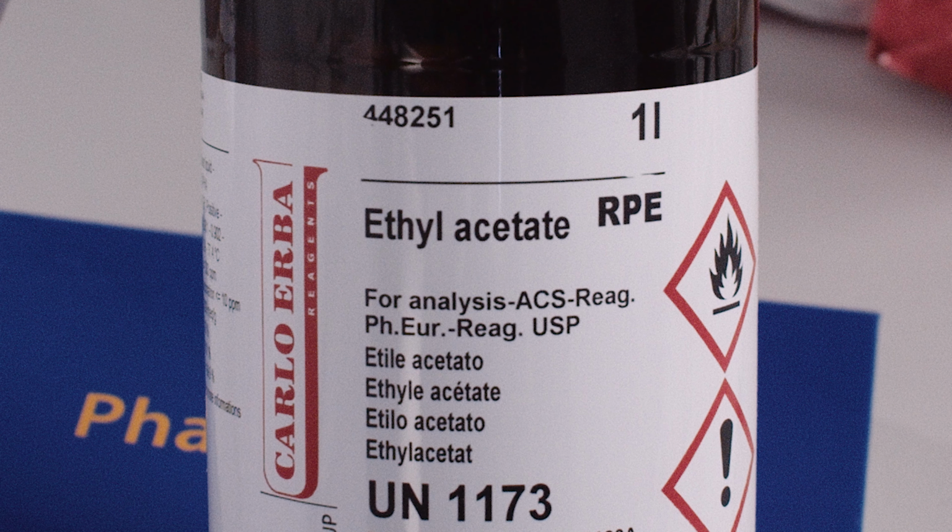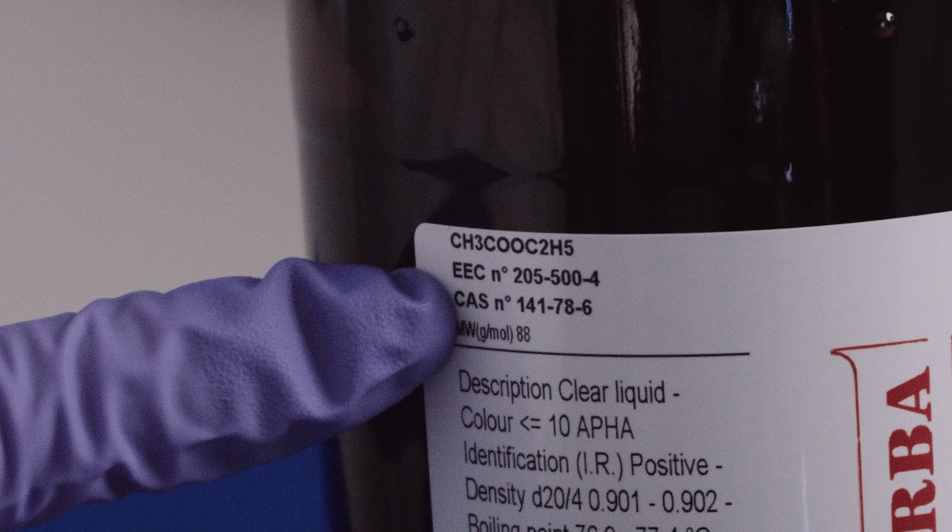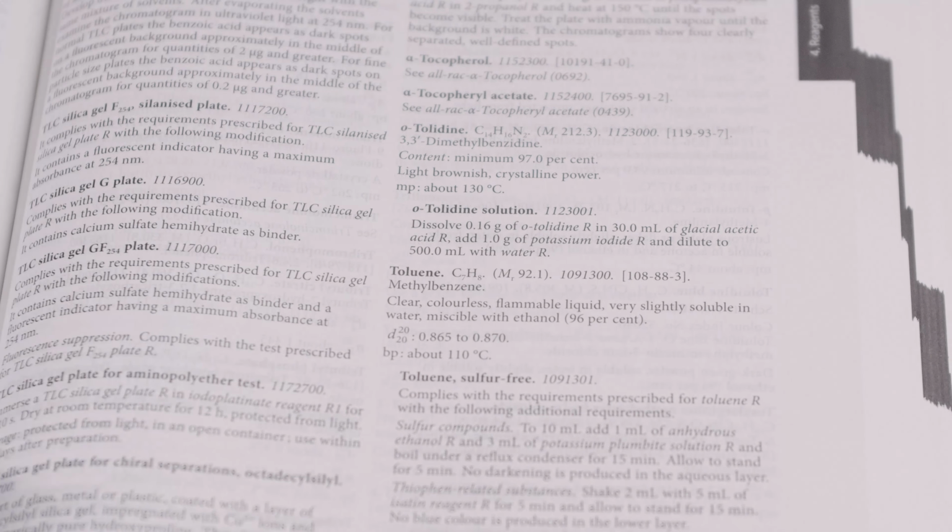In order to avoid the risk of misidentification of the chemical, we may provide a supplier with the unique CAS number of the American Chemical Society at the time of the inquiry or order. Like ethyl acetate, toluene and petroleum ether have their own monographs. Take care to purchase so-called light petroleum ether, which consists of a petroleum fraction with molecules with a boiling point of between 40 and 70 degrees Celsius.